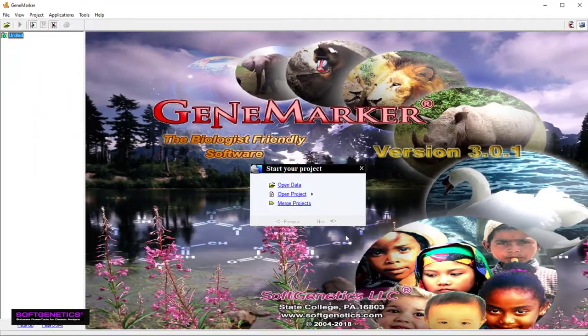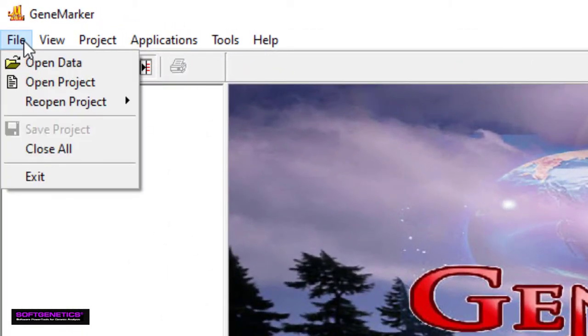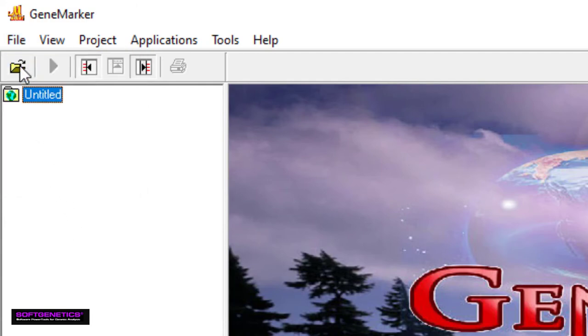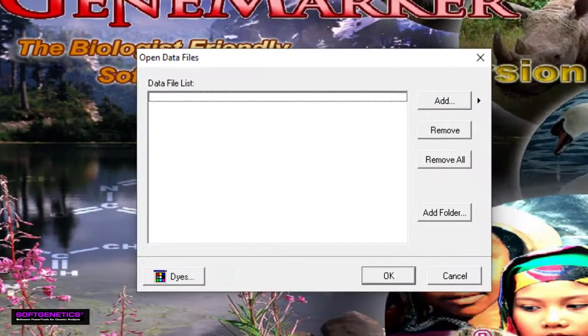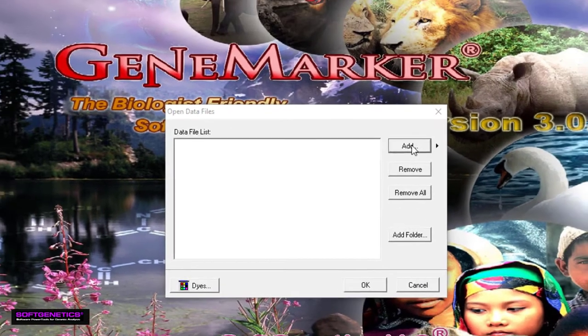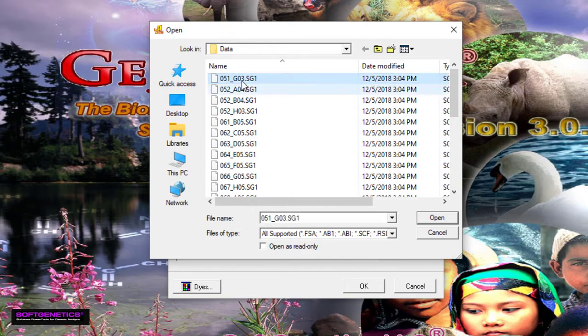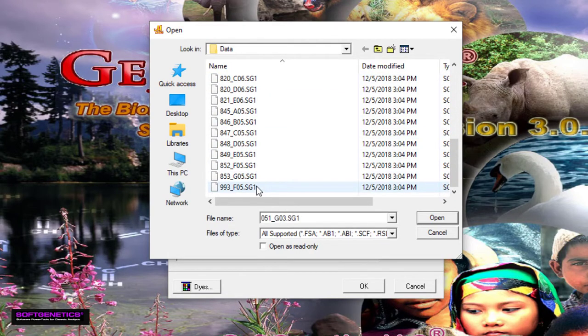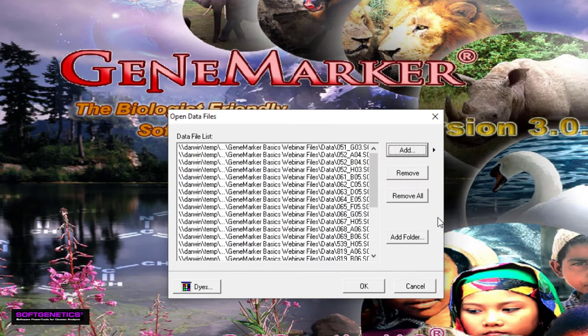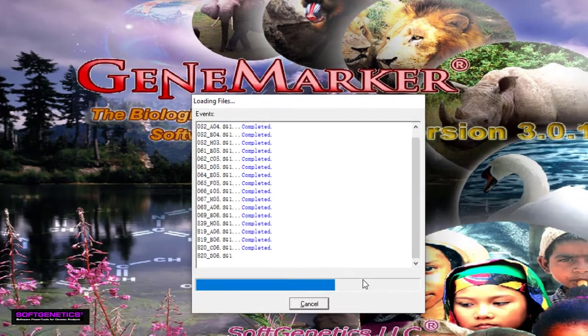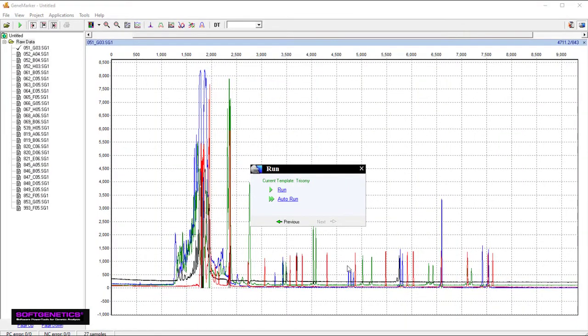When you are ready to load your traces, simply navigate to File, Open Data, or click the Folder icon. Click Add and then navigate to your traces. GeneMarker is compatible with file types from CE instruments including ABI Prism, Applied Biosystems Seek Studio, and Promega Spectrum Compact CE Systems Genetic Analyzers. Once you have your traces, click OK. GeneMarker organizes the raw data in the file tree to the left, and displays the electropherogram in the center.